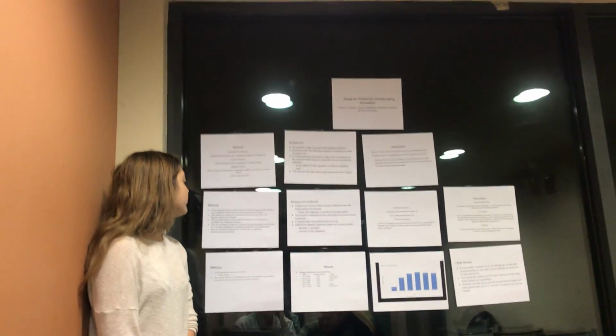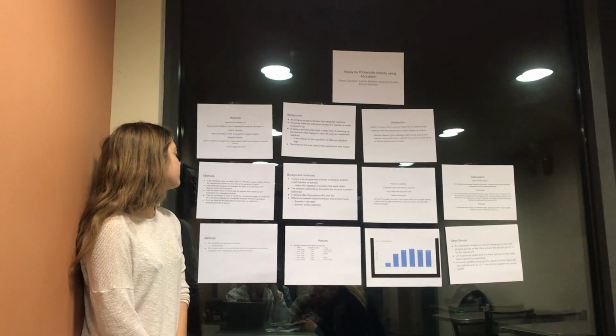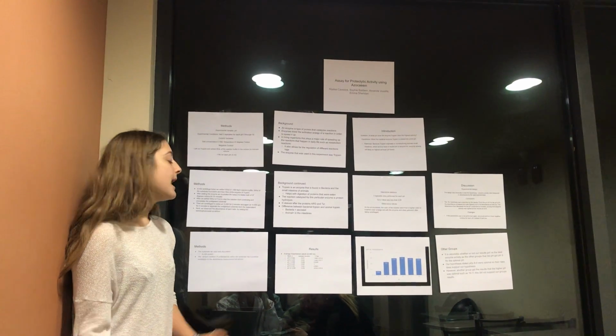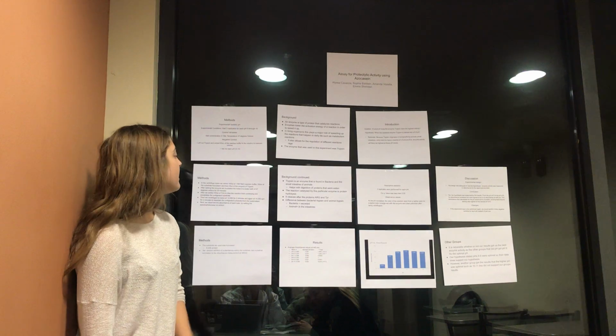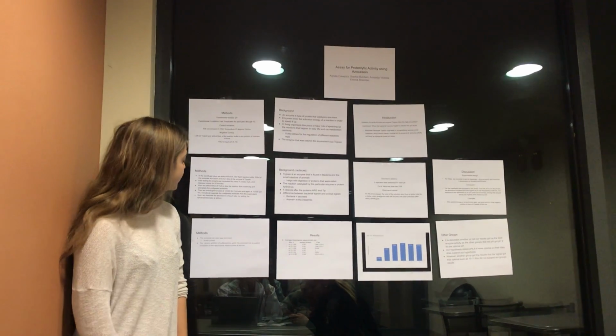After that, we added 50 microliters of TCA, which stopped the reaction from continuing and precipitated the undigested substrate. We then centrifuged the tubes at 12,000 RPM for 2 minutes, and again at 14,000 RPM for another 2 minutes, to separate the undigested substrate from the supernatant and basically form a little pellet at the bottom of the centrifuge tube.